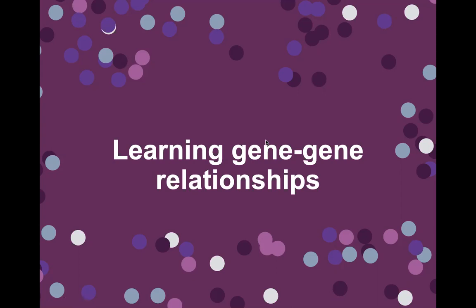I think the general answer is understanding your system and how that method works and what it might be sensitive to. So, for instance, we did talk about how diffusion distances are quite robust to noise. Some other ways of constructing trees or paths through the data may be less robust to noise, but they might be more sensitive in some cases. So these are the kinds of trade-offs.